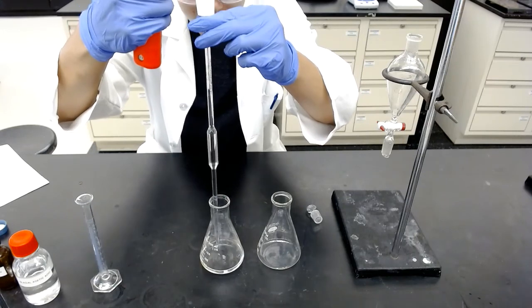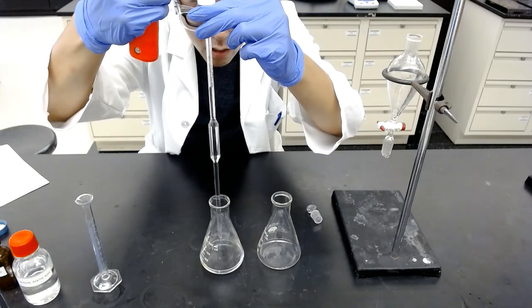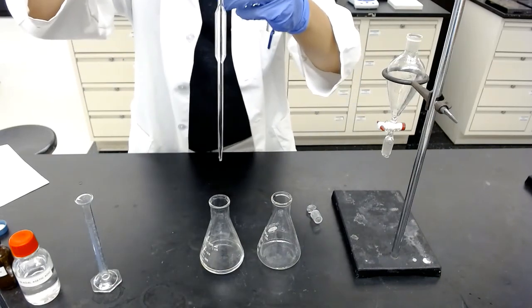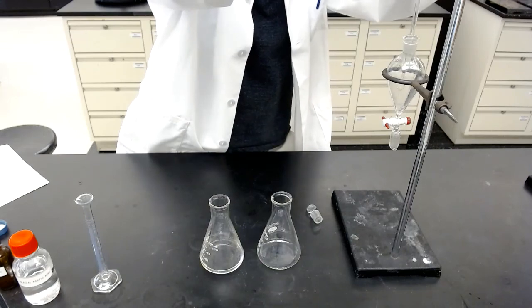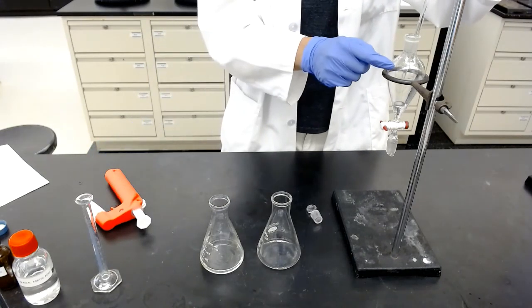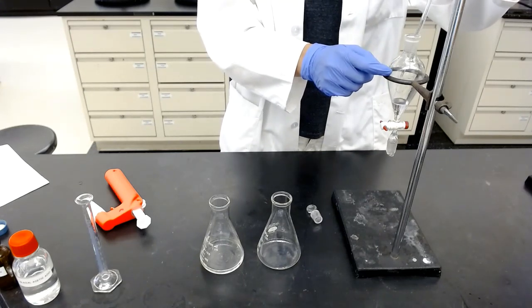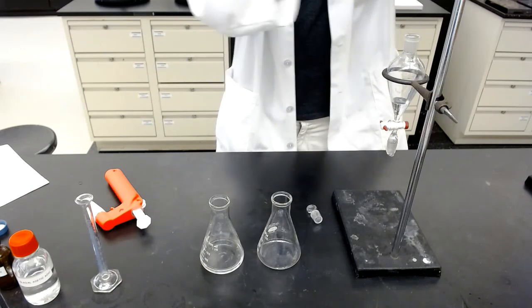Down slowly, of course. All right, there we go. Going to transfer this to a separatory funnel. Make sure the valve at the bottom is closed, otherwise you're wasting your time. Then this acid solution inside the separatory funnel is going to be extracted with 10 mL of ethyl acetate, which is a typical organic solvent, relatively nonpolar. All right, so transfer of the acid solution is done.